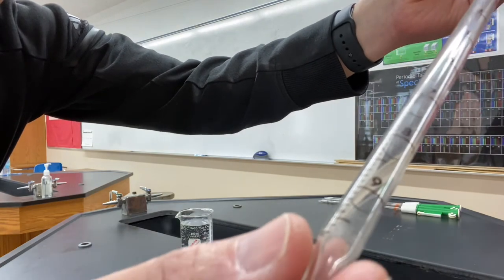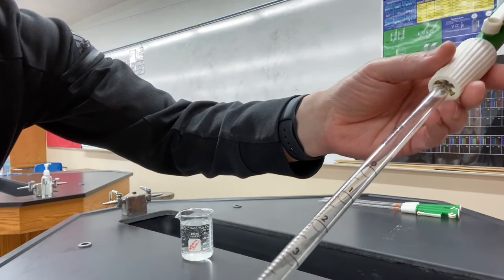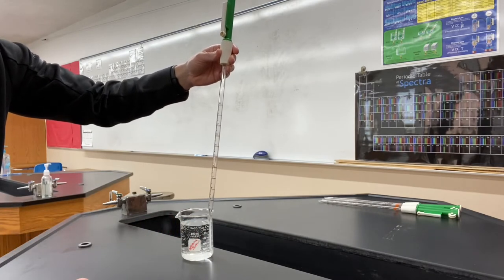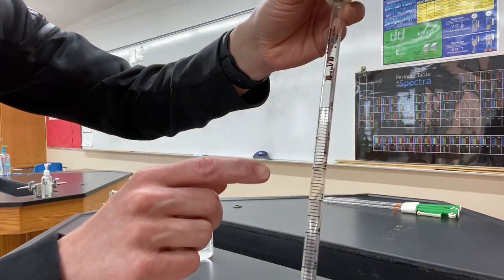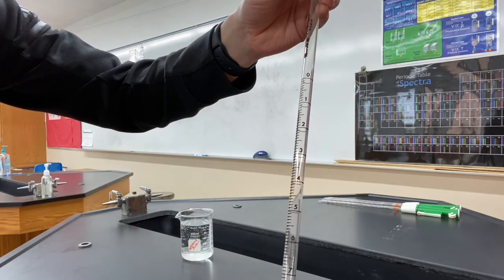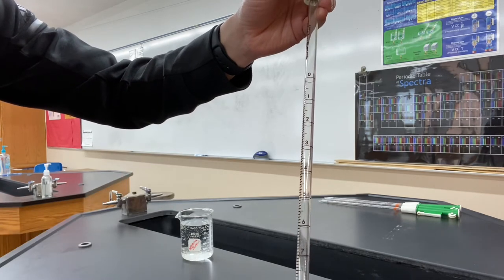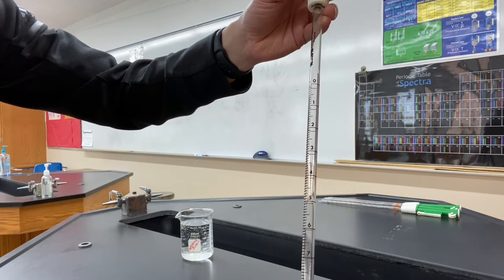We've got 9 down here at the bottom, going up to 0. And if you take the whole thing from the top mark to the bottom, it's going to be able to hold 10 milliliters of solution. It's also marked off in tenths. Okay, so if you needed to make a particular measurement like 7.4 milliliters, you would be able to do that. You read up from the bottom in terms of how much you actually end up delivering from the pipette.